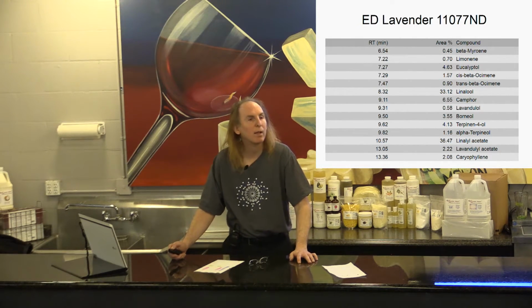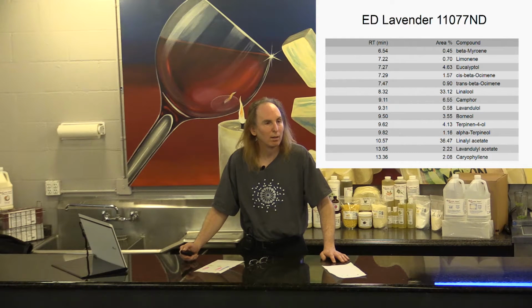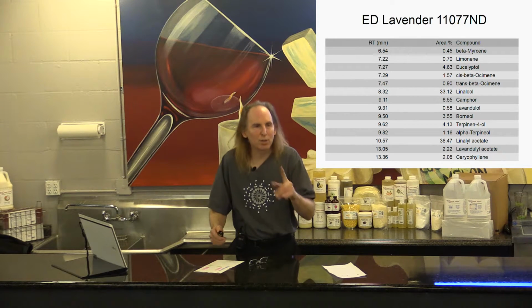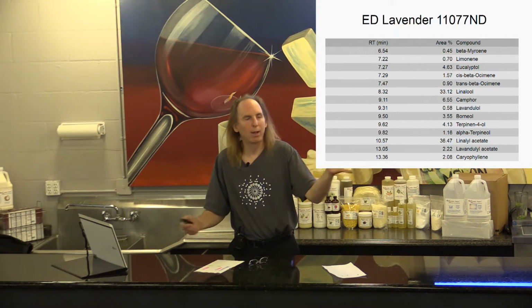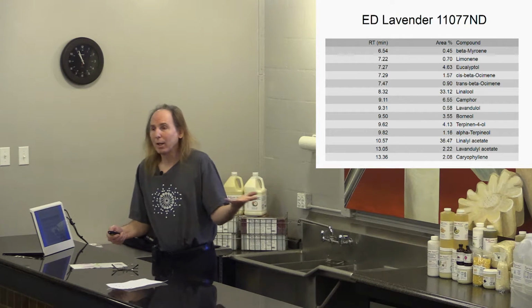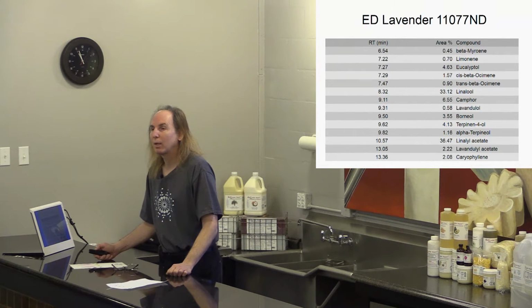Question? So ideally, the fewer compounds an essential oil like lavender has, the better quality? No. So the question is, the fewer the compounds there are, the better the lavender oil is. No, you couldn't be farther from the truth. And you also can't say the more compounds there are, because you know what? All I had to do was click a button. I could have found 100 compounds instead of 15.